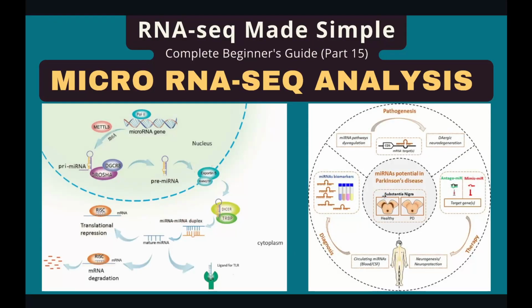In the last video, I showed you how to analyze small RNA sequencing data. Small RNAs are composed of many RNA species. Among them, microRNAs are probably the best studied small RNA species. They are derived from their hairpin precursors and then form the RNA-induced silencing complex RISC to regulate gene expression or translation. MicroRNAs are involved in many biological processes or diseases, and many of them are used as drug targets.